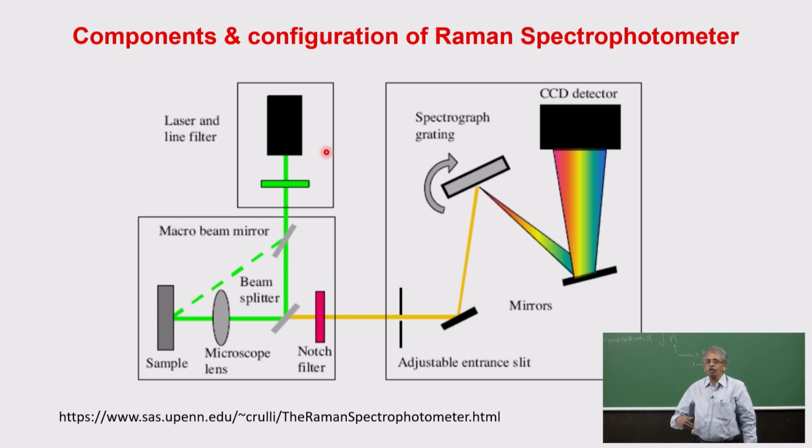Many techniques related to Raman were developed, such as resonance Raman and surface enhanced Raman. So Raman spectroscopy today is very broad, because you can study biological samples in aqueous solution, and inorganic samples on surfaces, such as heterogeneous catalysts, where a lot of other matter is present, and there is no problem at all.